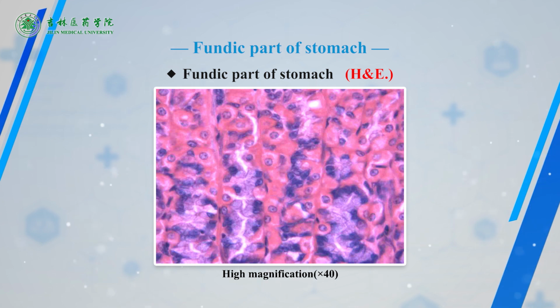the cytoplasm in the section often appears as vacuoles. Only the cell base remains strongly basophilic. The parietal cells are present mainly in the neck and the body of the glands. These cells are larger than the chief cells and round or pyramidal in form.